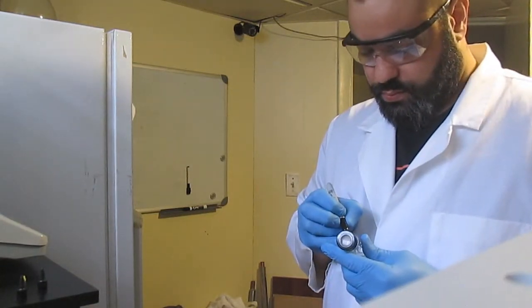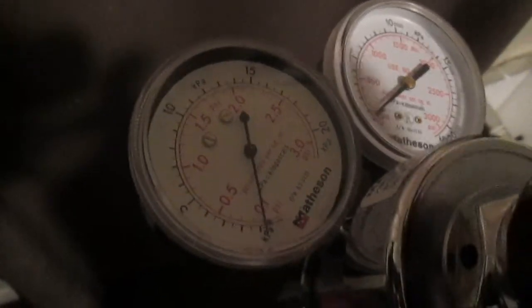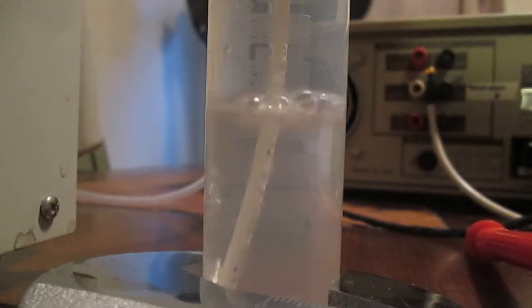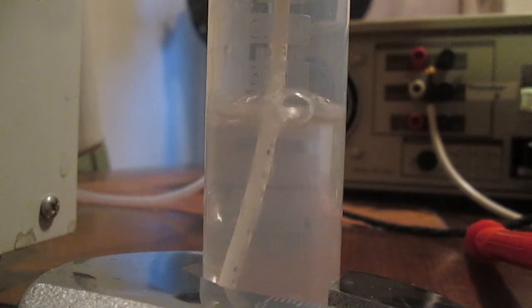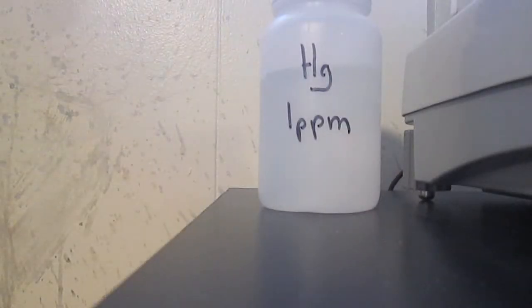Anyway, the setup is pretty simple and goes like this. I use low-pressure helium to bubble into a solution of 25 milliliters of the sample to be analyzed. The mercury vapors are carried to the cell inside the UV detector and the signal is recorded on the computer.